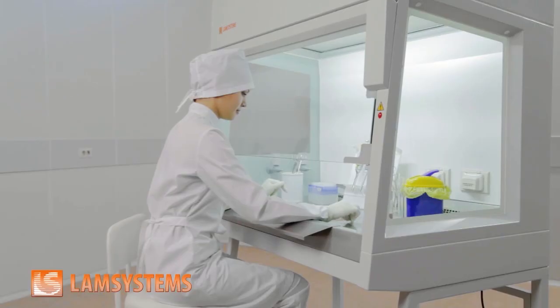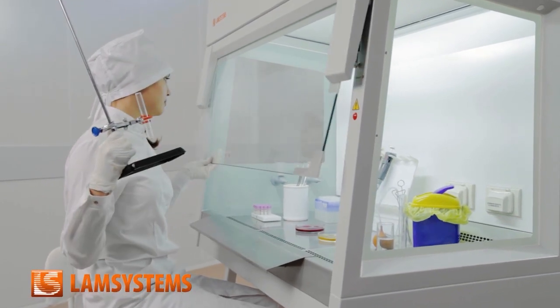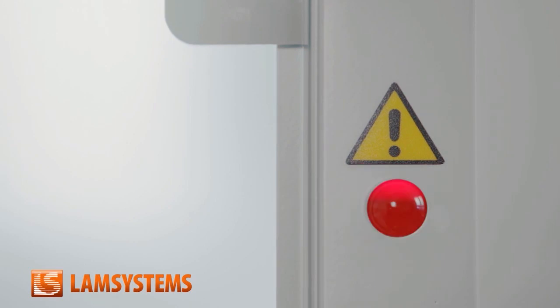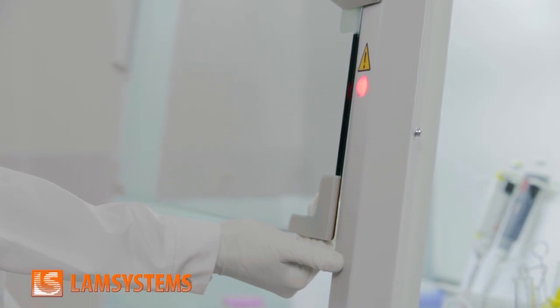But there are different situations. For example, the operator losing vigilance and forgetting about safety will decide to open the sash in the operating cabinet to load some more necessary equipment. To prevent this violation, the cabinet is provided with an optical sensor which activates when a gap between the housing and the front sash is just 5 mm.